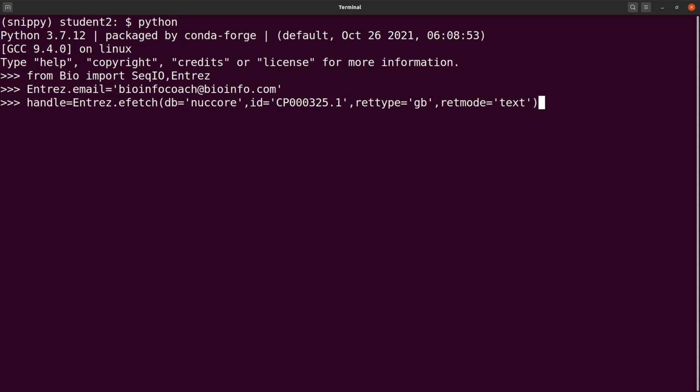And let me also say I have a separate tutorial that shows you how to use Python to download sequences from the NCBI database. In that video, I cover a lot of stuff, so you can just watch that if you are interested to learn more about how to use Python for this kind of activity. Now let's run this. Let's run and then just download the sequence data. So we have it here.